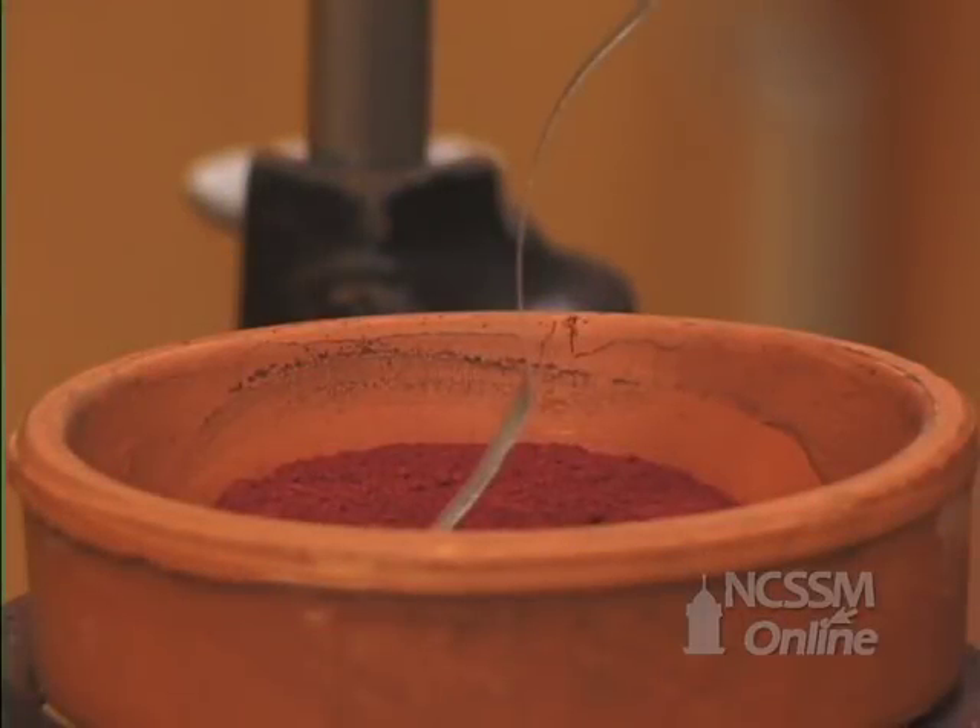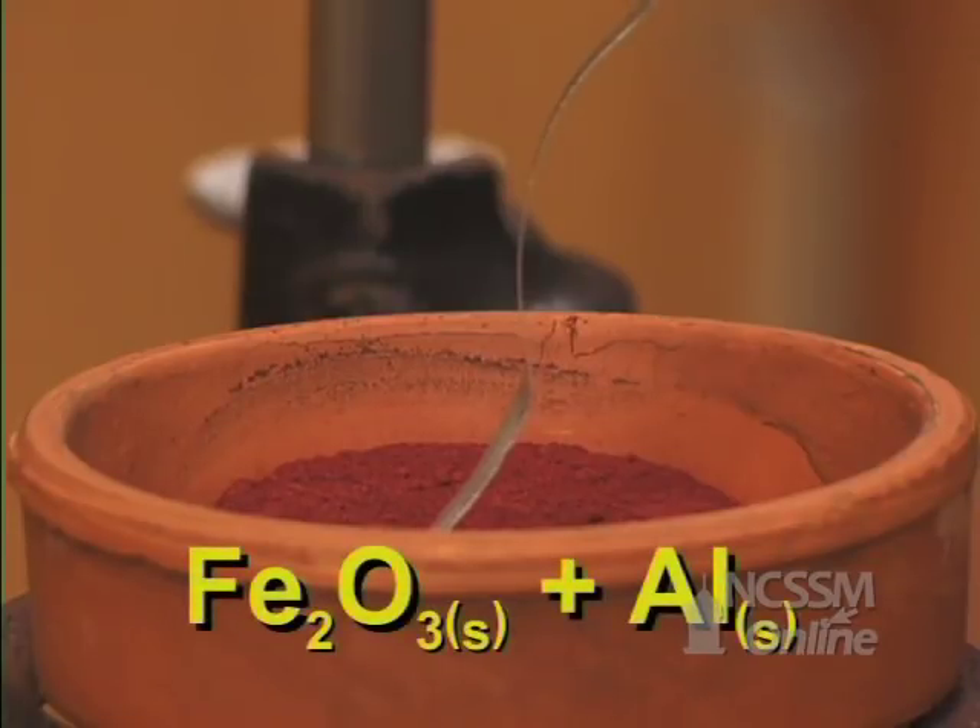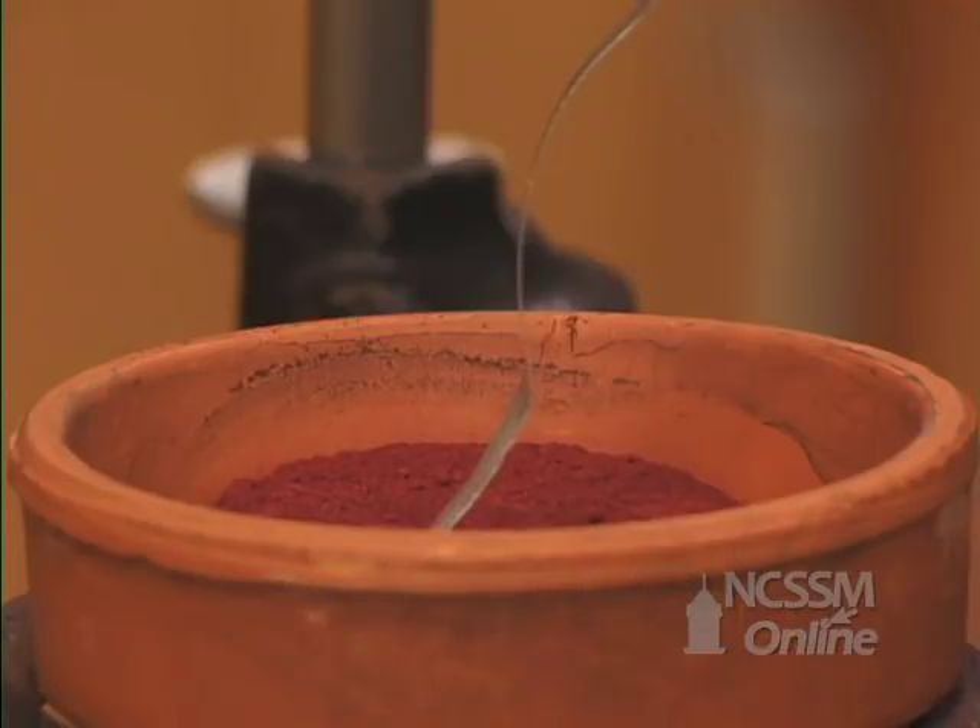We will use a thermite reaction as an example of a very exothermic reaction. The thermite mixture consists of iron 3 oxide and aluminum powder. A small piece of magnesium ribbon is used as an igniter.